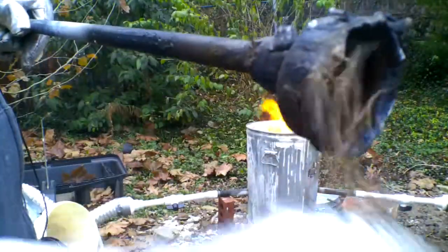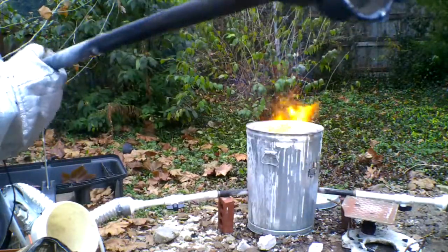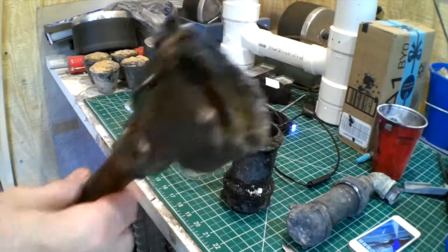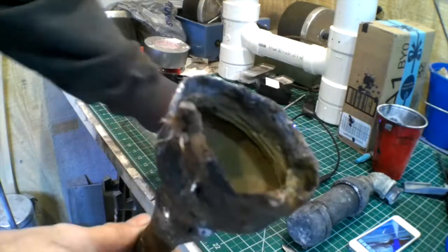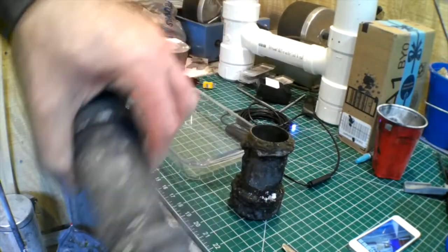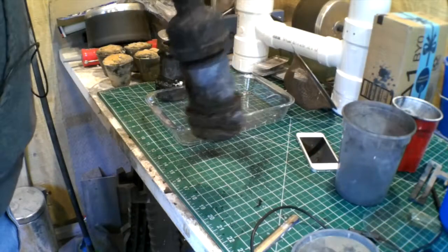There it is. That's what happens when you get things too hot. I'm afraid, damn, I just bought that pipe. I'm afraid this is that's a toasted reaction vessel. Let's do a post-mortem on this particular session. So there's the top of my retort. The rest of the top of my retort is still on the top of my retort. I've melted retorts before, as you know, but I've never caused a complete breakdown in the integrity of the vessel before, so I guess congratulations.